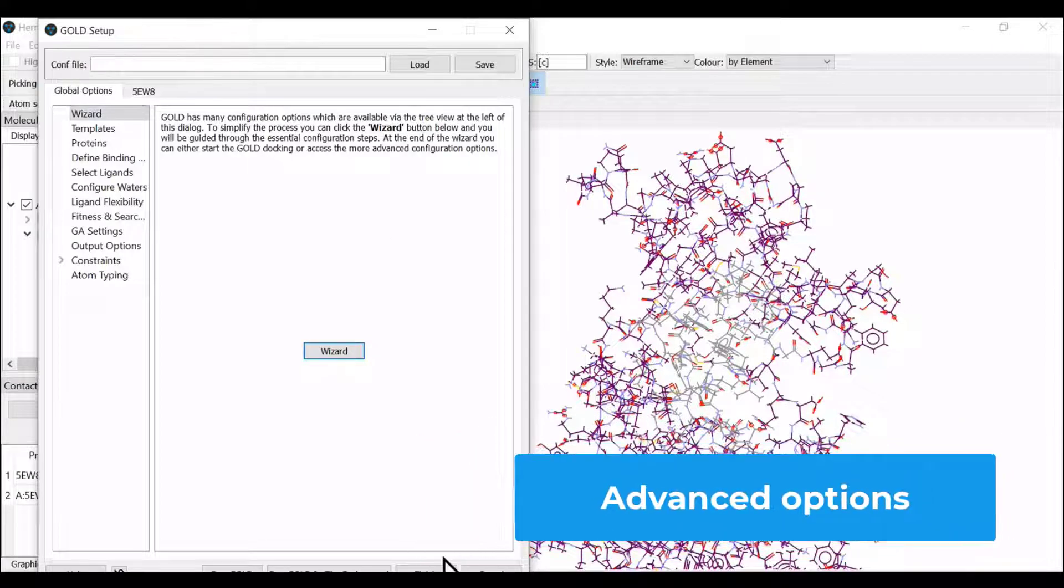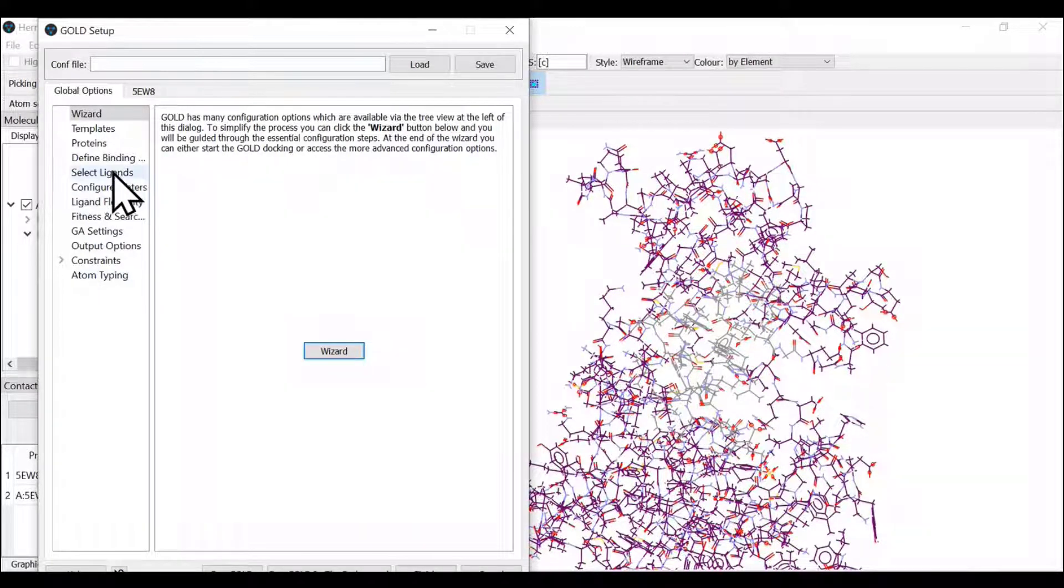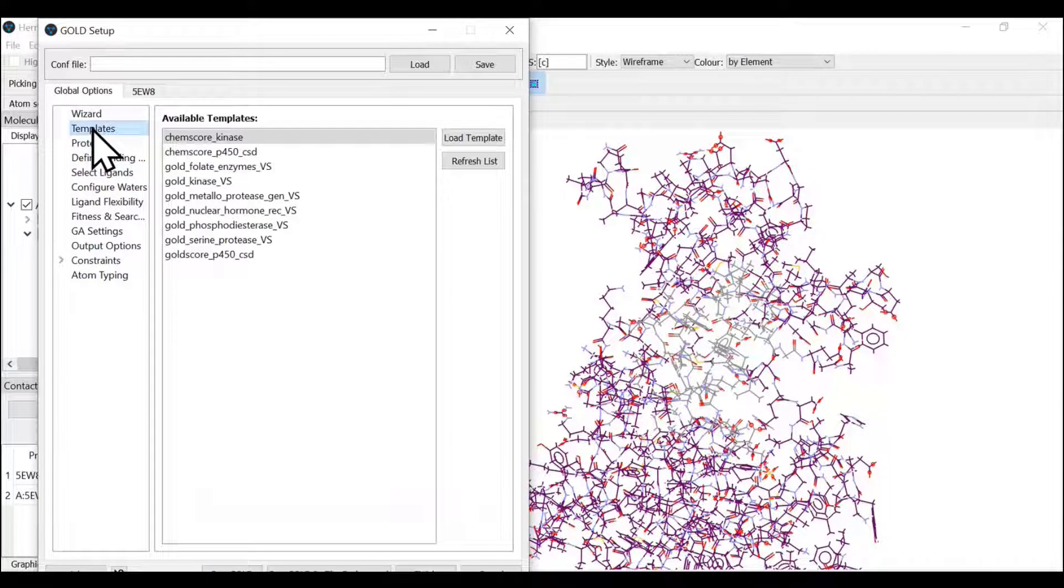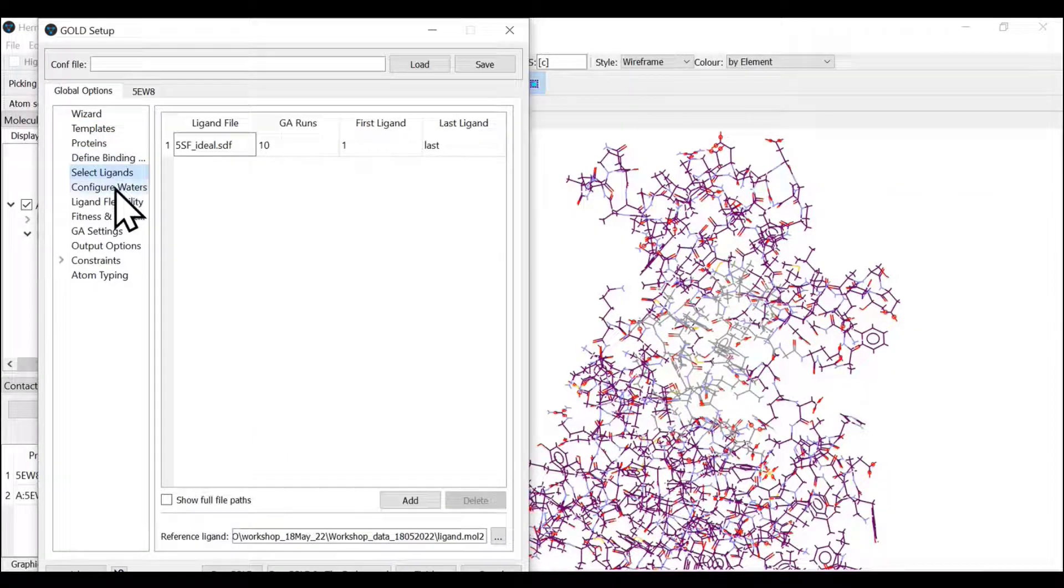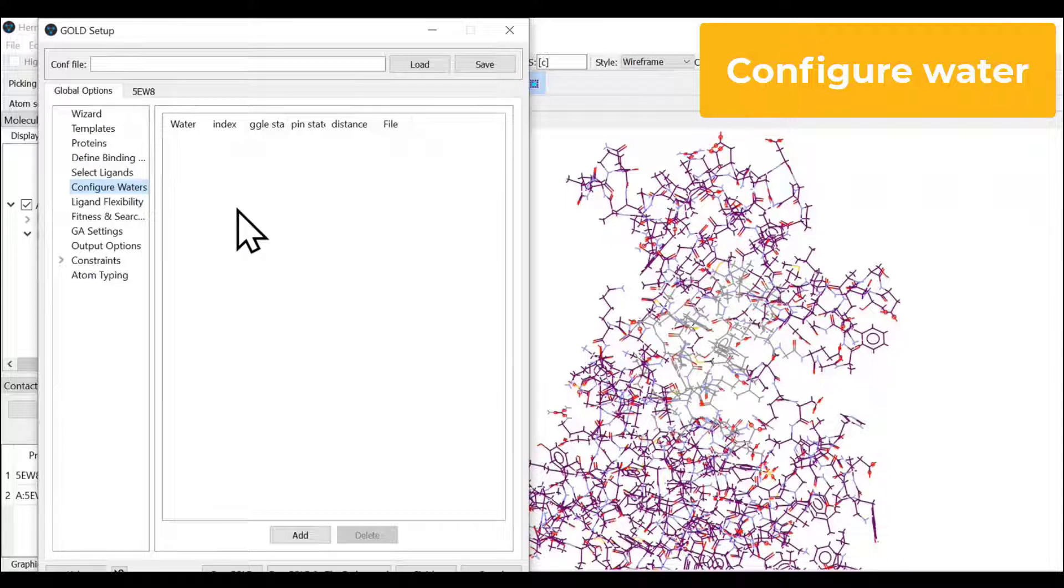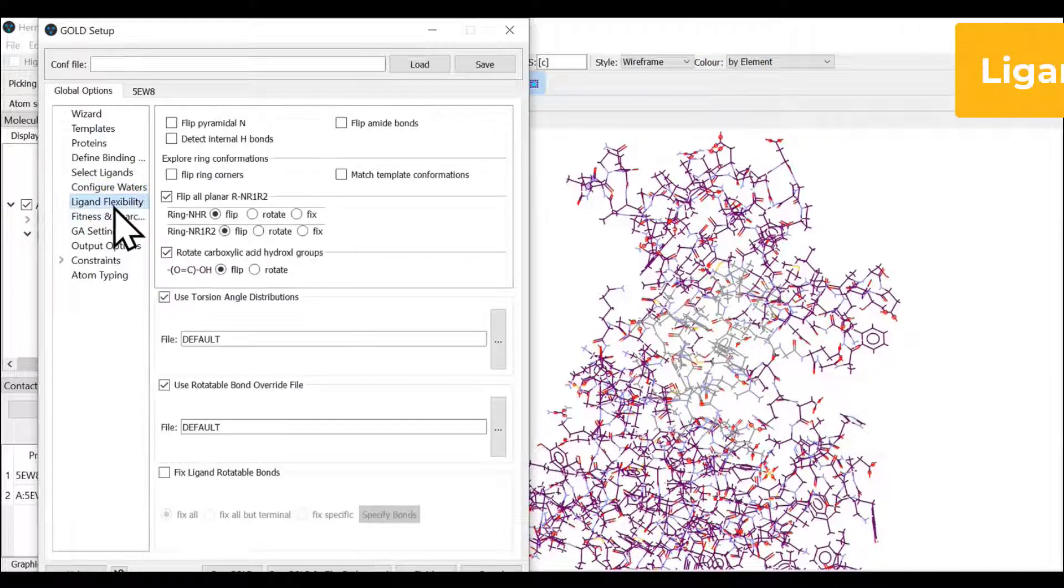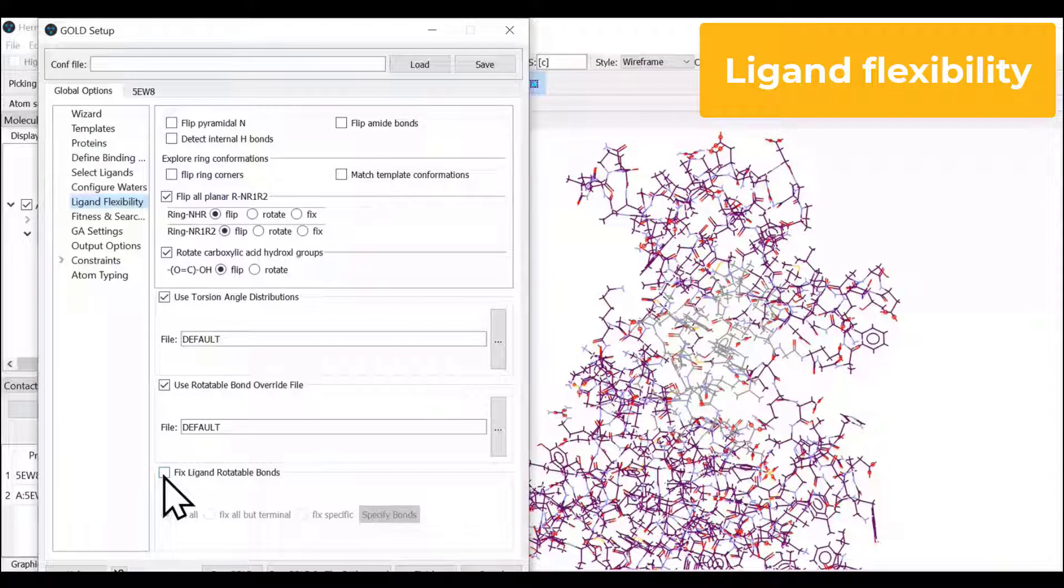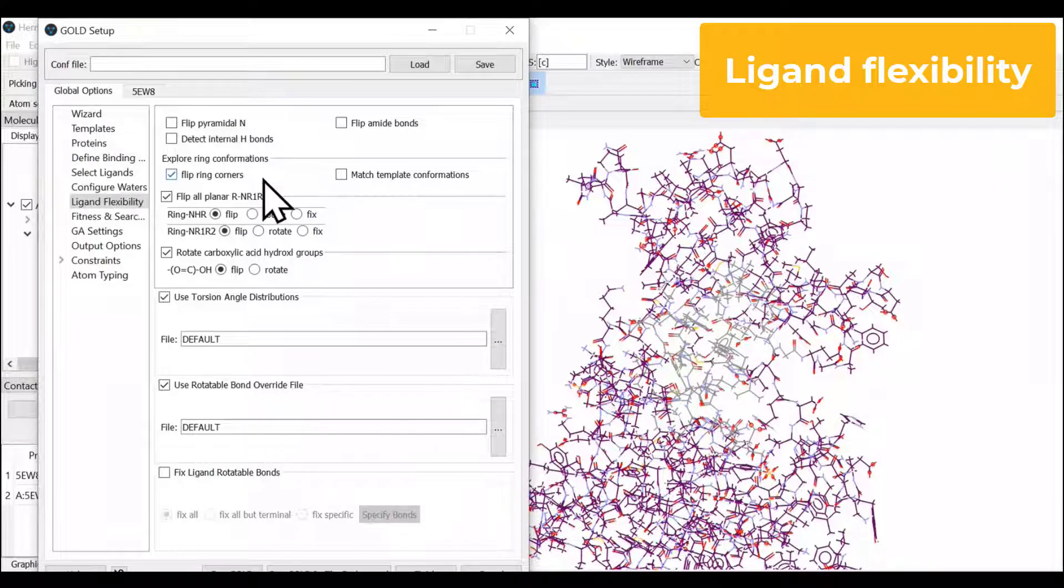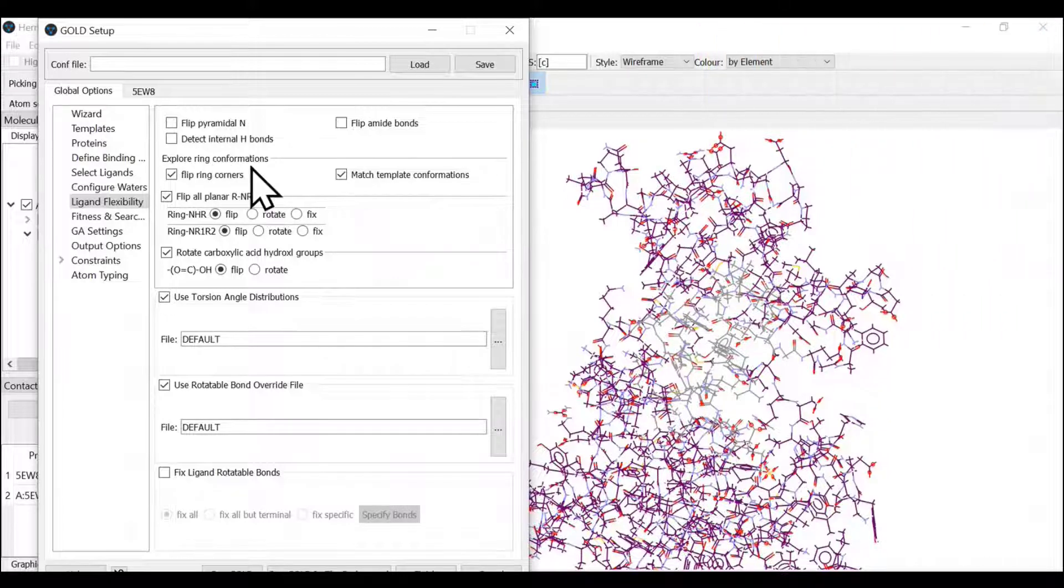Once you click the advanced option, the global options on the left hand side tab will show all the other possibilities in GOLD. We have protein, defined the binding site, and selected the ligand. The configurative water function helps in selecting any water of choice or functional water. For ligand flexibility, you can perform rigid docking using fixed ligand rotatable bonds, but we're interested in flexible docking today, so we're selecting all options of ring confirmations.